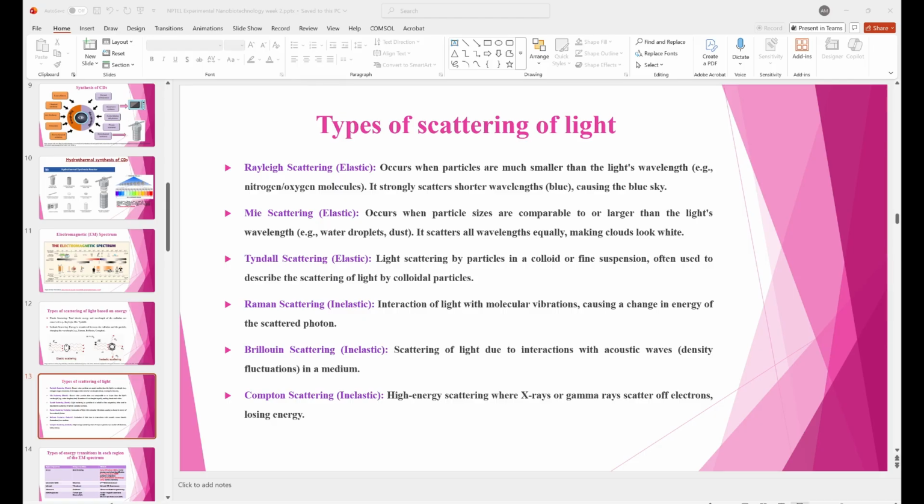So here what kind of transition happens? Bond breaking happens. So X-rays, like I said, it is ionizing radiation. So bond breaking occurs when you expose a material to X-rays. So the methods which use X-rays, one example is X-ray diffraction, which you have already been taught. It helps in crystal structure identification. We will see some examples of crystal structure. I think it was mentioned in the video what kind of crystal structures you have, but I don't know if it was elaborated or not. So I have included a small slide for that. And phase identification.